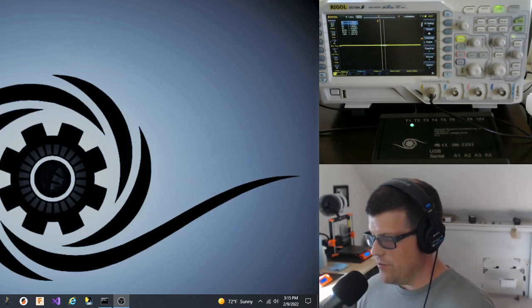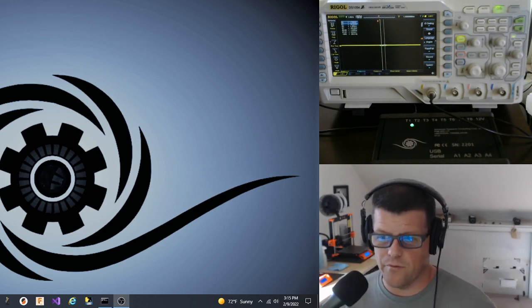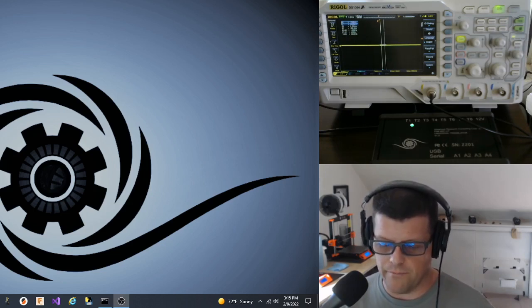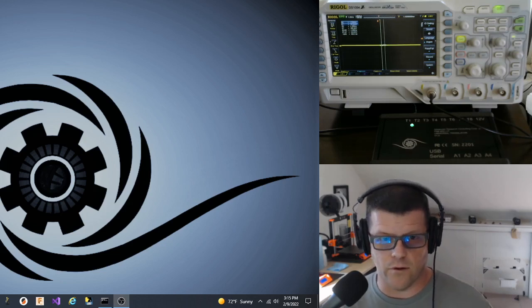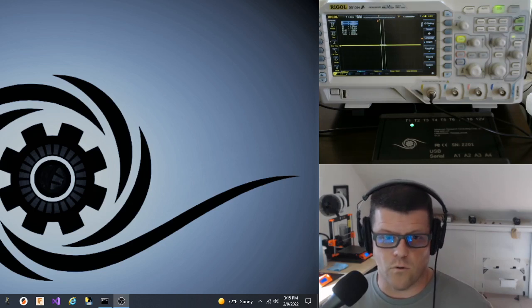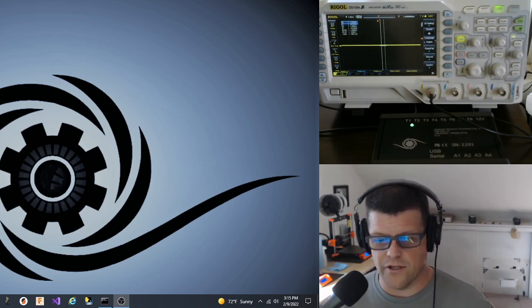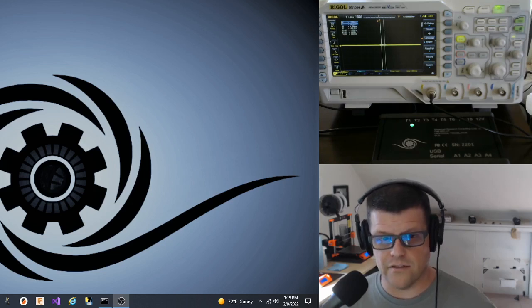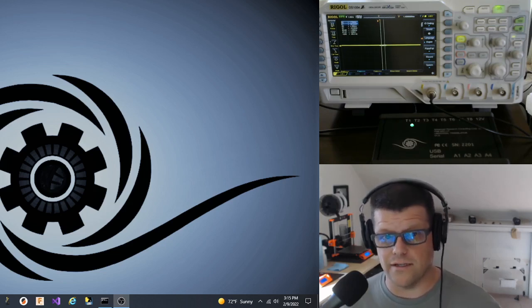The Universal Translator was basically built because of a common frustration that I've had as well as other people in the industry have had. I know that several different people that work in a similar field to mine, where we're trying to build microscopes, integrate them, and generally get things working that are oftentimes not designed to work together, all have this frustration. That is, what do I do if I have a commercial piece of software that there's not really a good interest to support a device, but I also have a customer that really needs that device to do their research or to expand on their work?